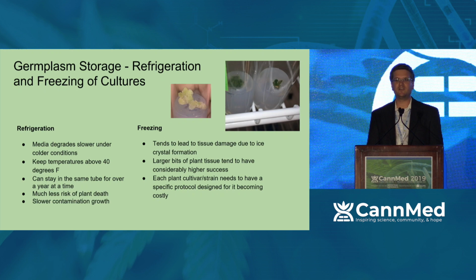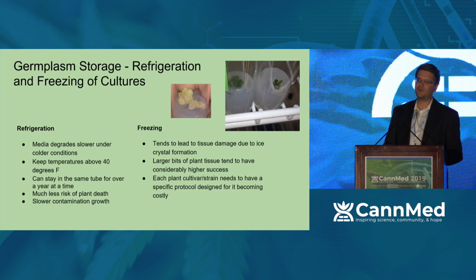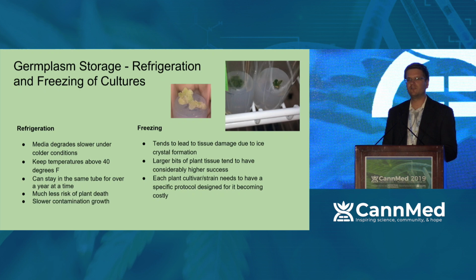Do not go lower than 40 degrees on your plant tissue. You're essentially starting to freeze it and you'll get a lot more cell death. And I should also mention that your contamination, although slowed down, can still be there in a refrigerator. I've stored test tubes for a long period of time in a refrigerated condition, and when I pop them out 3 or 4 months later, I can have a world of contamination if I didn't keep that refrigerator sterile in some way or another, or didn't keep the room it was in sterile. So it's very good to know you need to do this in a pretty clean, I'd recommend ISO 5 standard lab or better.